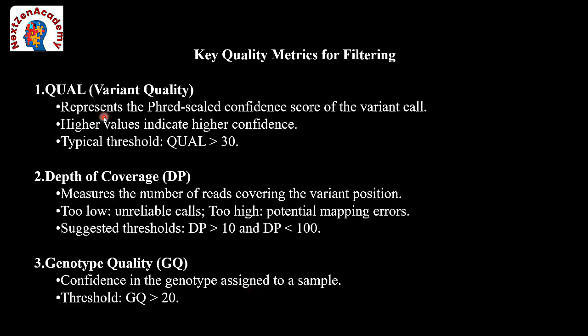And you can see the operations when we are working with the VCF file. To do filtration, filter the VCF file with quality greater than 30, filter the VCF input file and exclude the features. The excluded features are low quality features, and they get filtered out.